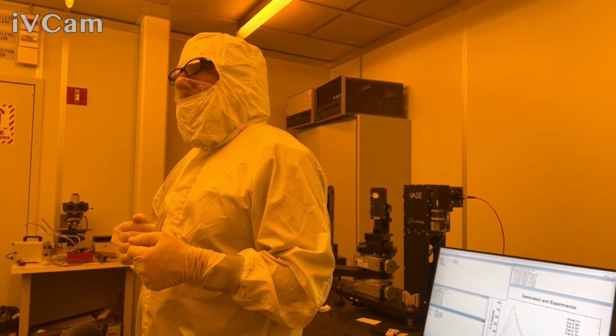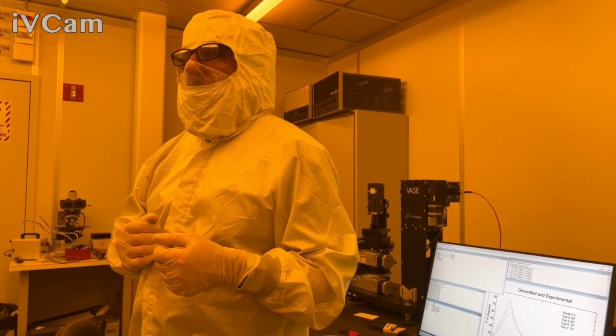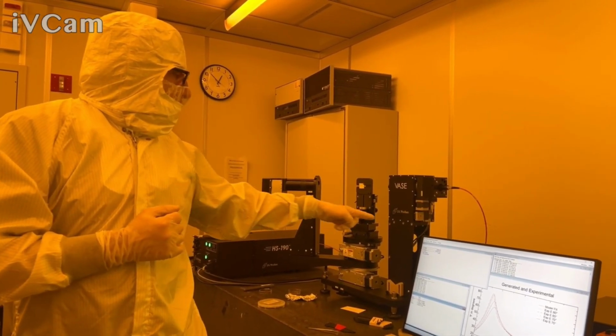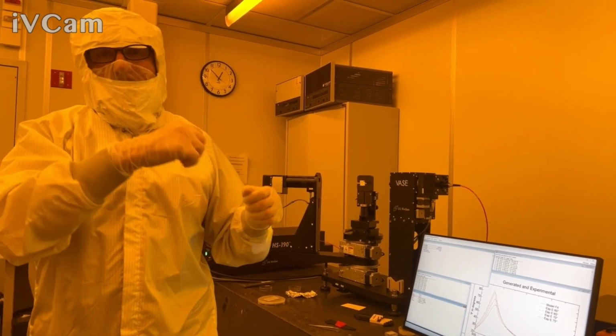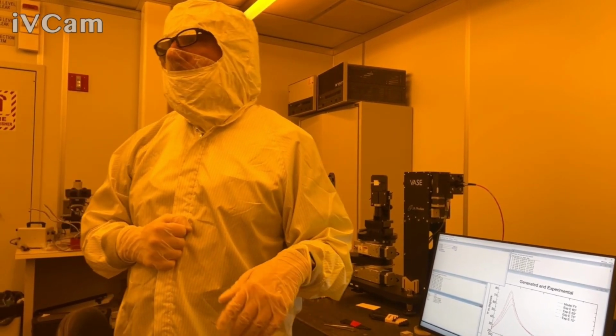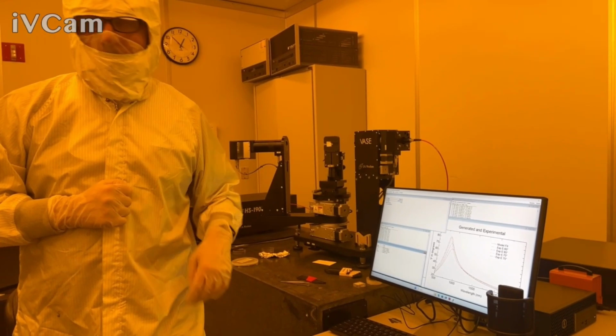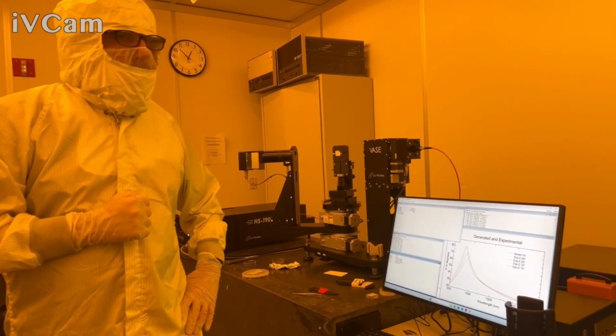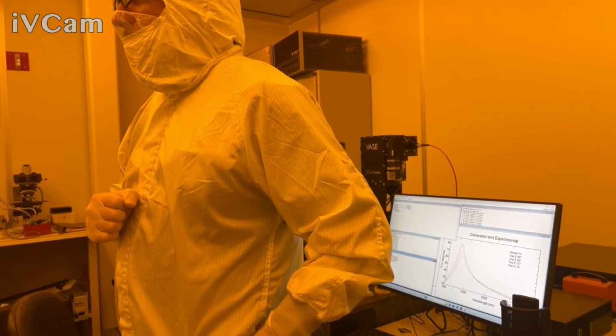I see. So mainly changing the lamp is the main thing. And just be careful with the optical fiber. That red fiber right there is pretty well where it is, but try not to snag it if you're walking back there. Nobody should be walking that side. But in general, there's not really any preventive maintenance I can think of.